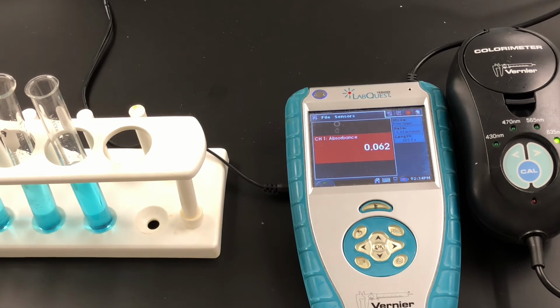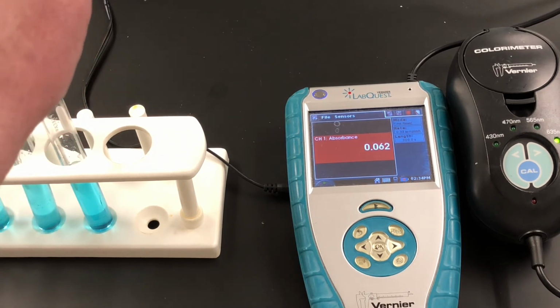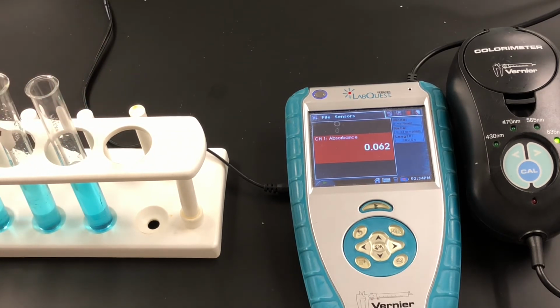I gotta be honest, that trial number 4 doesn't look so good. A little worried about that one. There's not much of a difference between these two trials. I'm wondering if I screwed something up. Let's do this. We're gonna do trial number 4 one more time. I'm gonna mix that up again. So trial number 4, we need 8 milliliters. Just seems like those are awful close together, so hopefully.